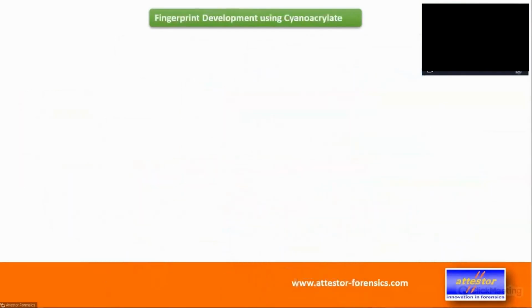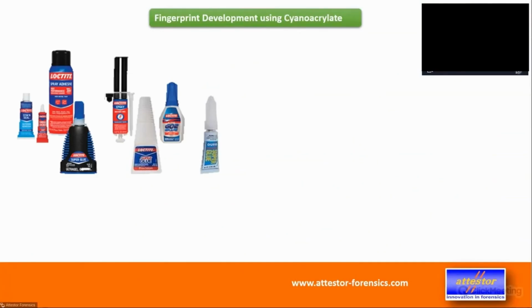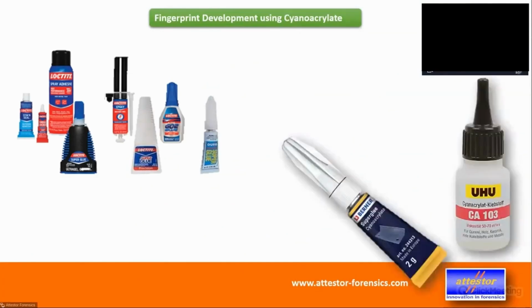Right. So let's go into cyanoacrylate fuming. I don't have to explain to you what cyanoacrylate is, so sorry for that slide.